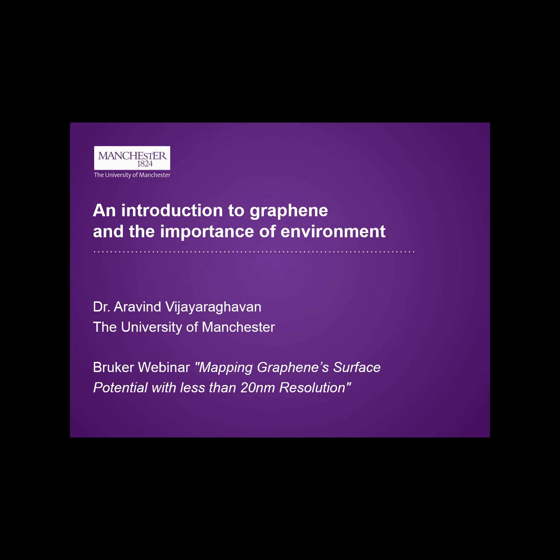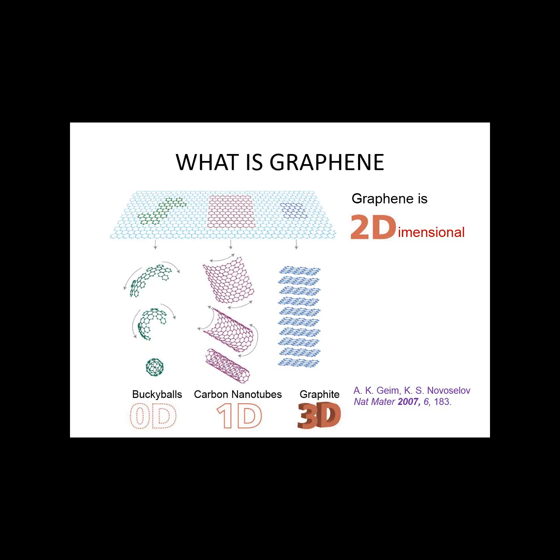I'm just going to give you a brief introduction to graphene, about just a few things about what graphene is, how we make it, and just a couple of slides about why the PeakForce KPFM mapping of surface potential is important. It's important for various reasons, but I'll give you one or two important reasons why we would like to do that.